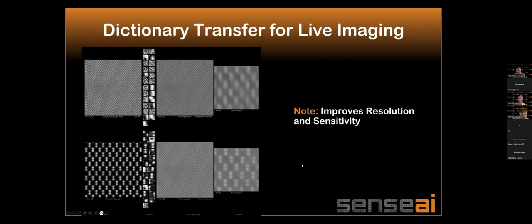So what we can do in this approach is actually begin to self-correct for some of the artifacts that come in when we acquire an image. And because we can acquire it live and run this live, it means that as the user is on the microscope, all of these modifications can happen as you're actually looking at the sample.